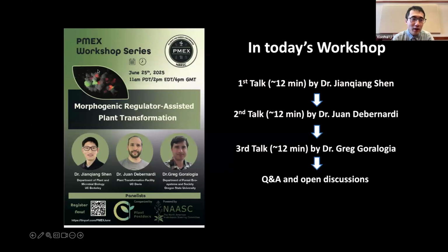Our next question is for Greg. Greg, could you expand a bit on why using SPEC is important in your system? Yeah, so spectinomycin, and there are a few others that do this, primarily target plastids. And so if the tissue itself is kind of etiolated, there's not as strong of a killing effect.